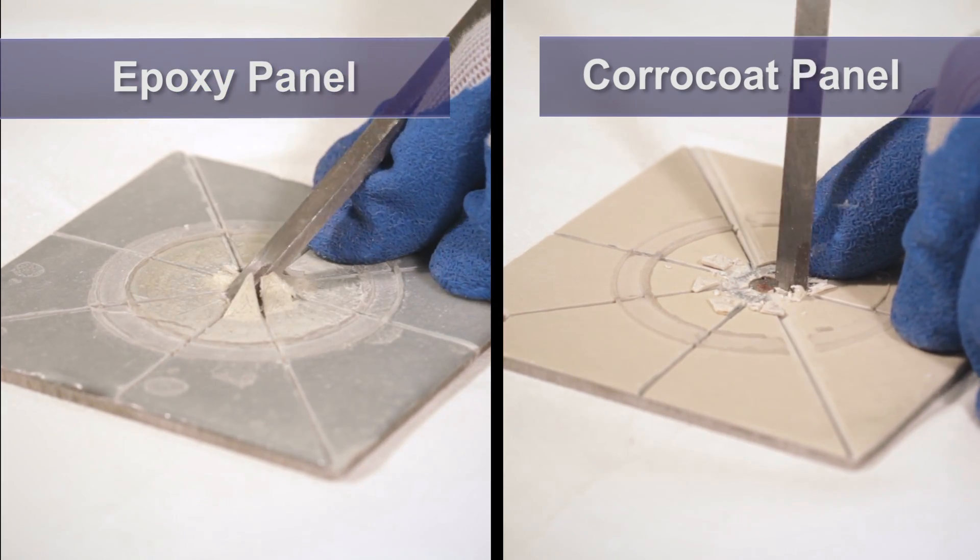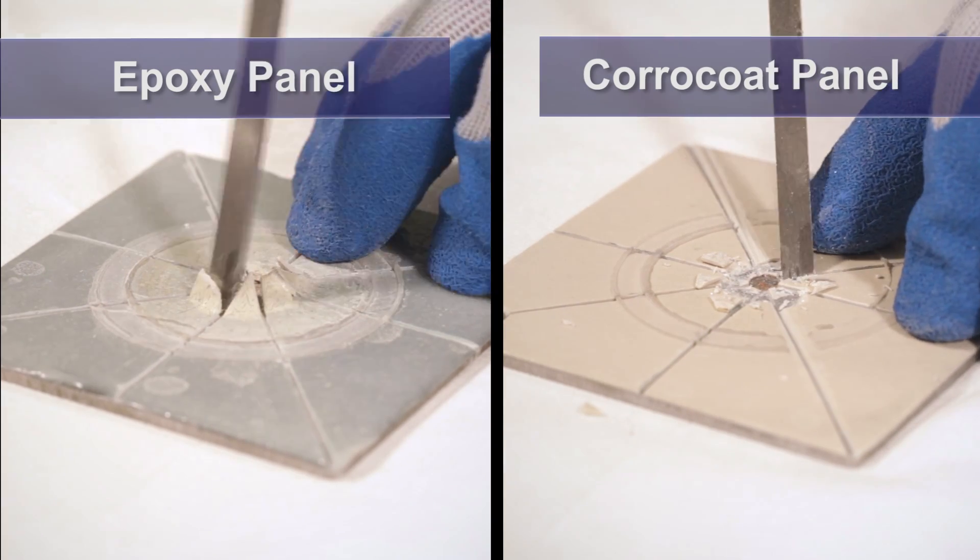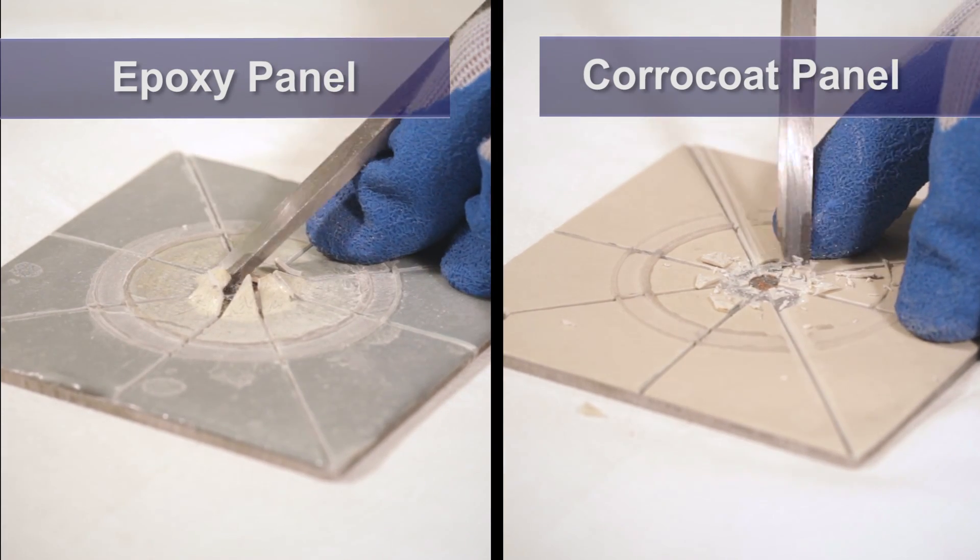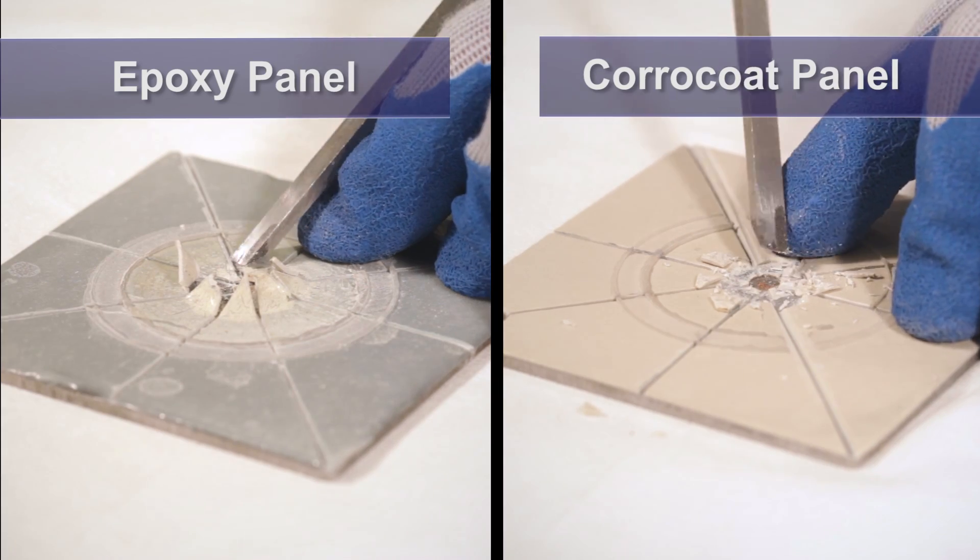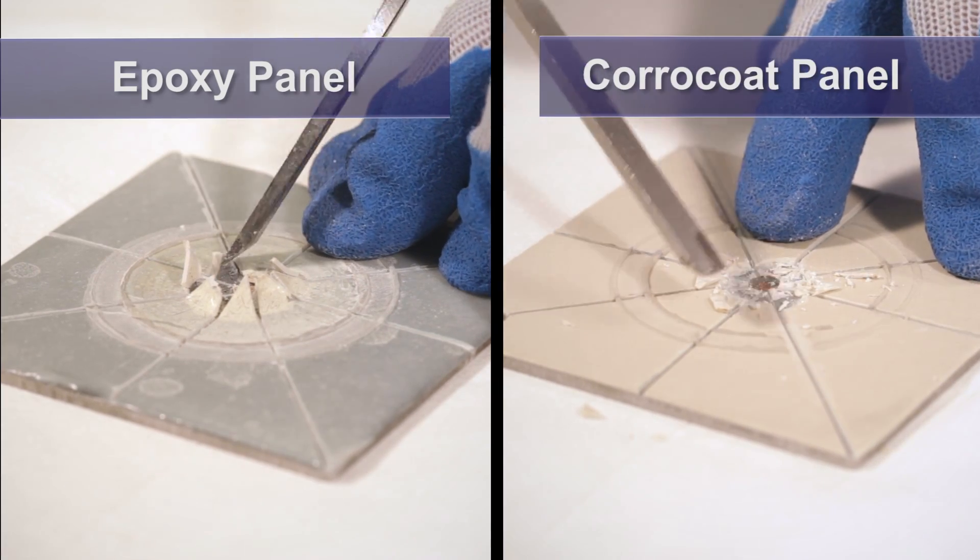As loss of adhesion is not always obvious, the substrate is carefully examined to determine if there are signs of residual coating which would indicate that disbonding has not occurred.